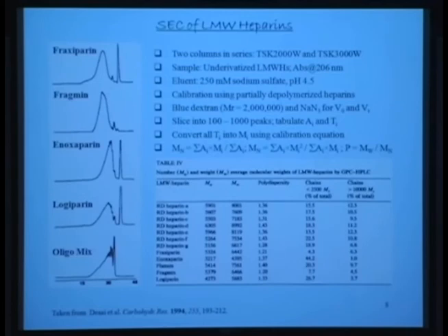Okay, so we have a fingerprinting profile that we had developed. It's a very useful technique to characterize low molecular weight heparins. Now in those fingerprints, what we wanted to do is, how about characterizing each peak using the fingerprint? So can you do that? So we purchased all these oligos that you guys also purchased.